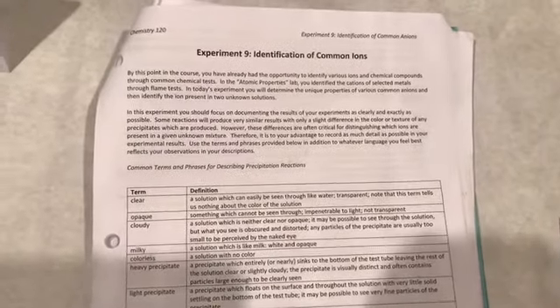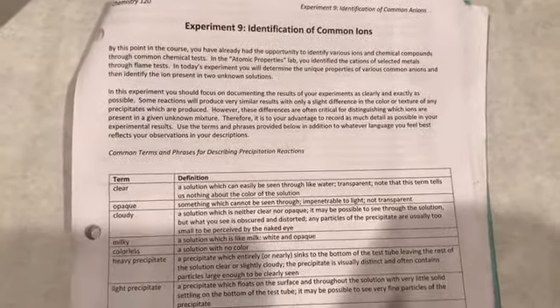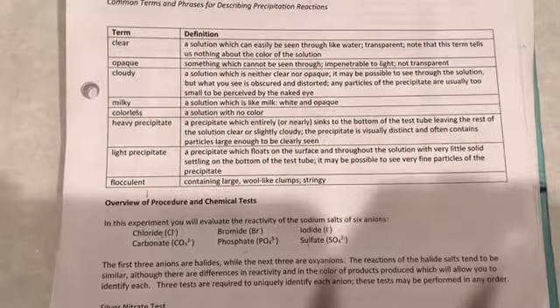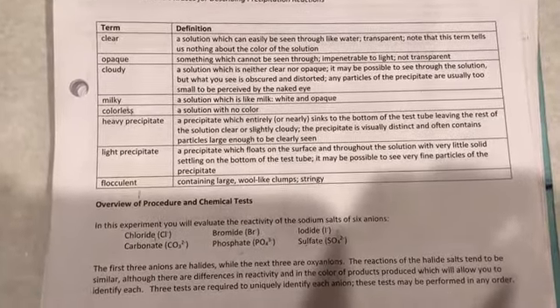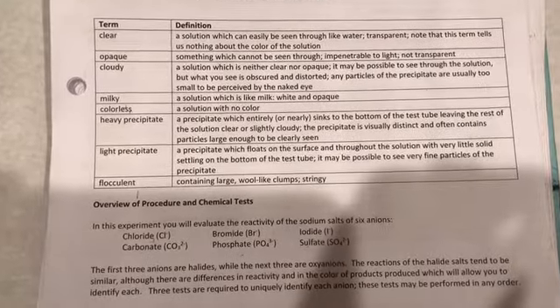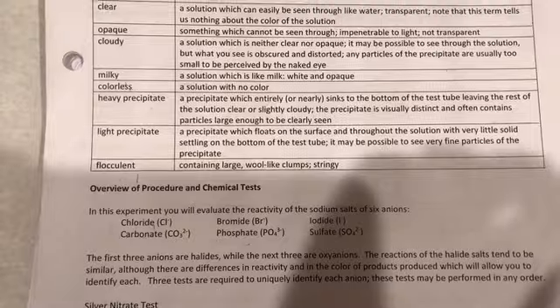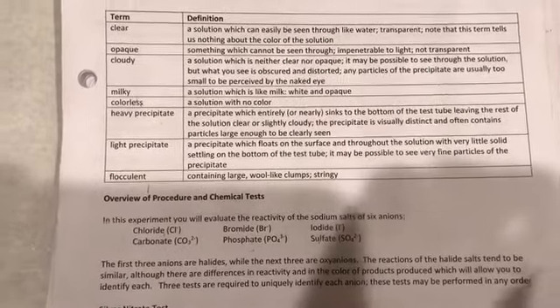Alright, so let's start experiment number 9, identification of common ions. In this experiment, you are going to identify 6 anions: chloride, bromide, iodide, carbonate, phosphate and sulfate. And among these 6 anions, 3 are oxyanions and 3 are halide anions.